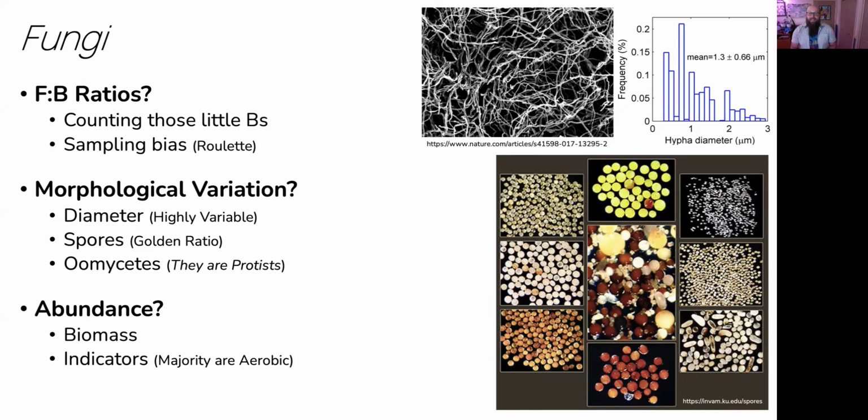And then spores. I've put an example here of AM fungal spores. They're quite variable, and I want to see that variety. If we take just this idea that, oh, it's a spore of a certain size or a certain color, it's therefore mycorrhizal, I don't think that's necessarily going to be as informative of the reality as seeing this general variation in the spores.